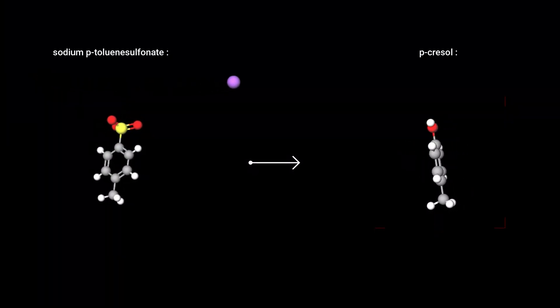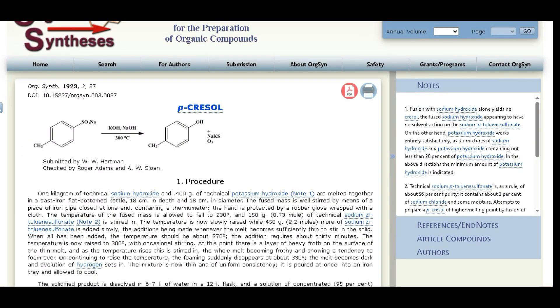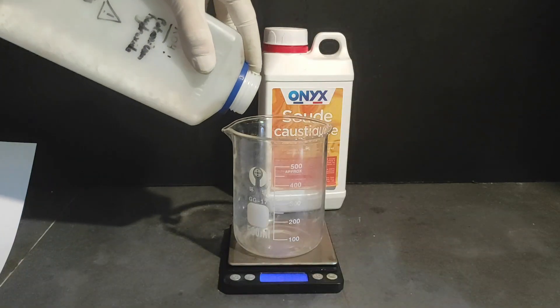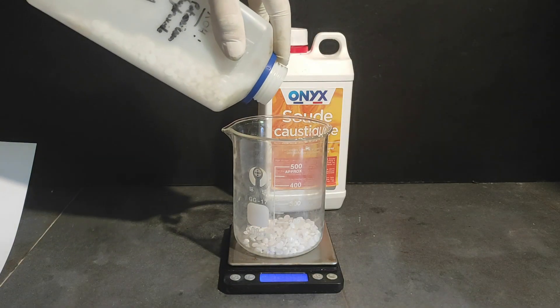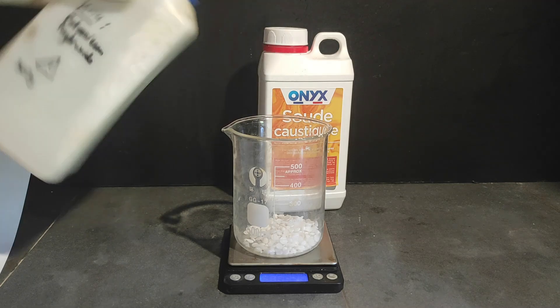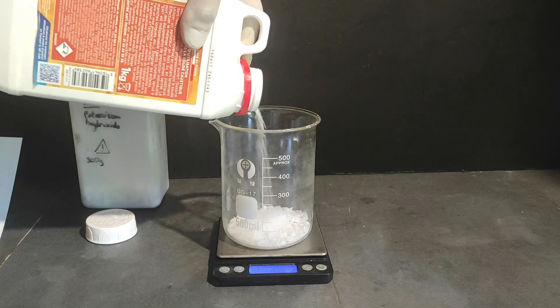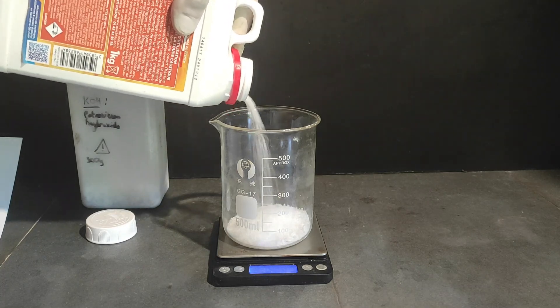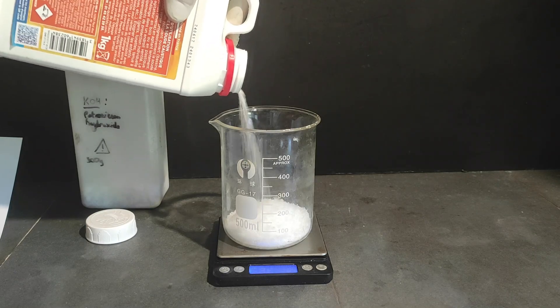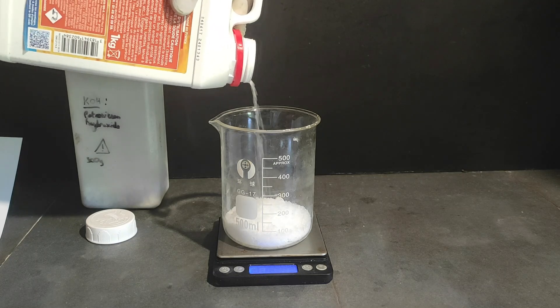Now that we have our sodium para-toluenesulfonate, we can actually start to make the para-cresol. To do so, we will follow this procedure from the Organic Syntheses website. I first measure 40g of potassium hydroxide in the beaker, and then 100g of sodium hydroxide. If you are wondering why we don't just use sodium hydroxide even though it's cheaper — the main reason is that if you only use sodium hydroxide, the reaction will straight up not work, because the sodium para-toluenesulfonate won't dissolve at all in it. So you need at the very least 23% potassium hydroxide according to the paper.